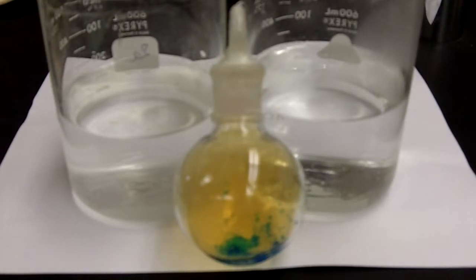Purpose: to investigate the effects that various changes or stresses have on dynamic, chemical, and physical equilibrium. Furthermore, to use Le Chatelier's principle to explain the shifts in equilibrium observed in this investigation with regards to concentration and temperature.